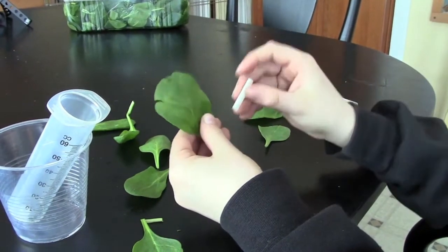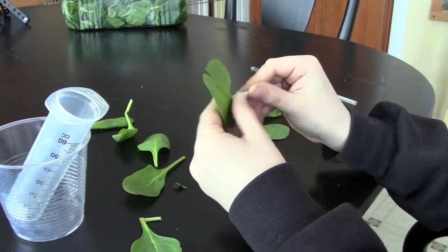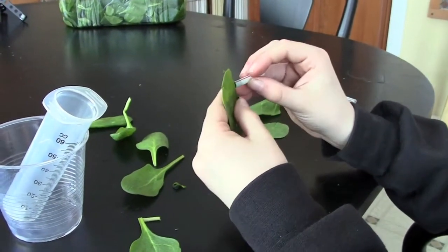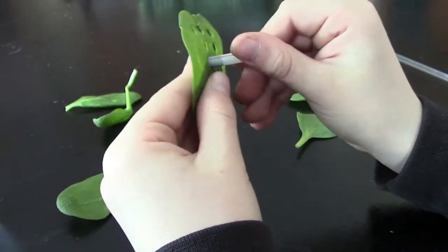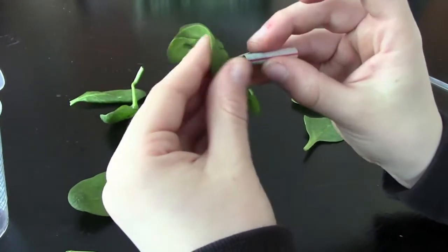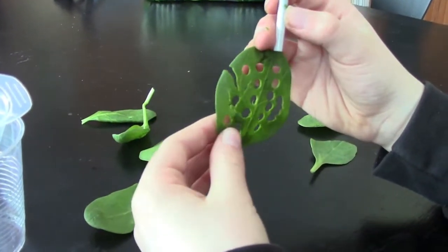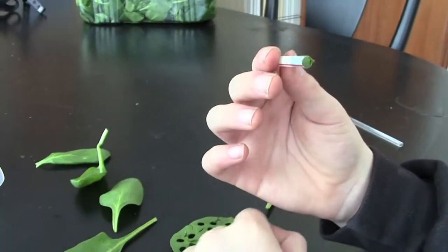First, you'll take the straw and you'll poke holes through the spinach leaf. Try not to get into the center. When you're done, the leaf should look like this. And this is what your straw will look like — you can see it's a little darker there. Your leaf disc will be inside.